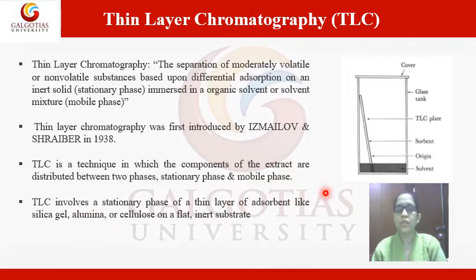This TLC plate can also be prepared in the laboratory. A slurry of silica gel is prepared, then it is coated over the glass plates. Then it will dry. After drying, we can use this plate for TLC identification.